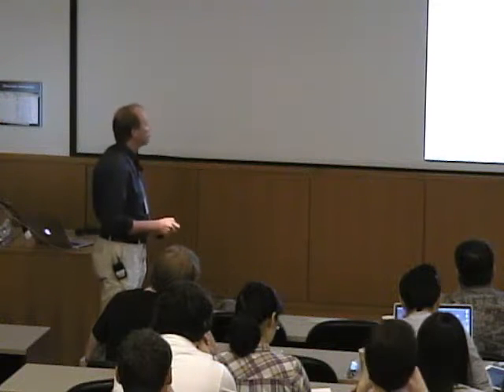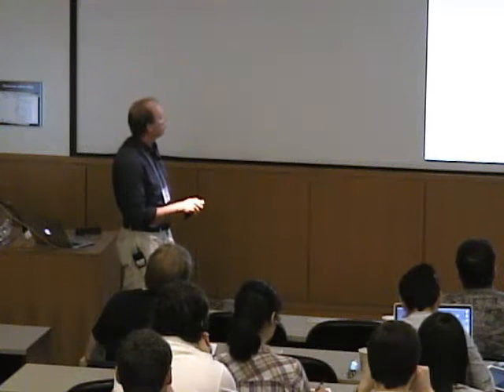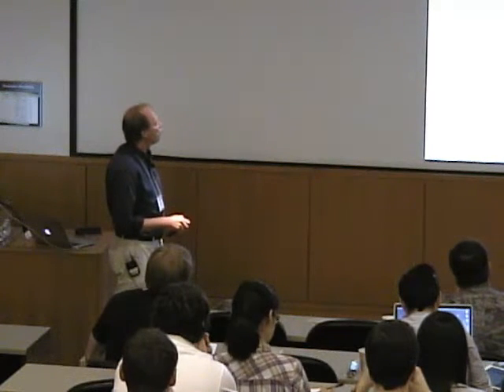So if we're looking at a molecule, an electron in a molecular orbital usually does not have orbital angular momentum, or at least it's quenched, right? And so this means that our J here is approximately equal to S, and our g is approximately equal to the free electron value. So this factor which determines where we would observe our resonances, this g value, is approximately equal to 2. But the exact g value depends on how strong the spin-orbit coupling is and how much residual orbital angular momentum is present, right?